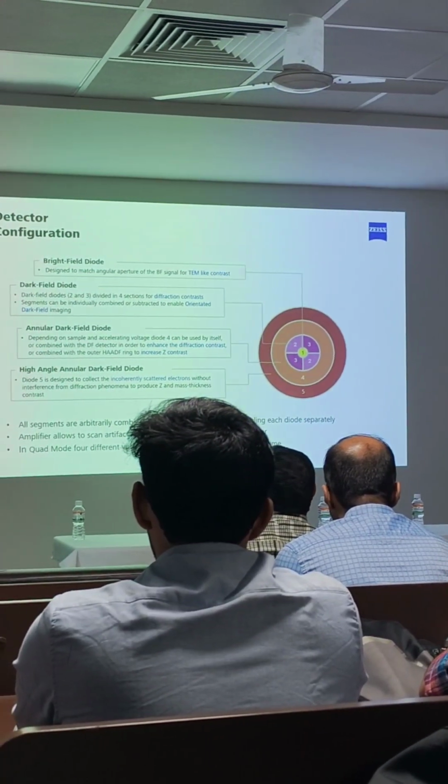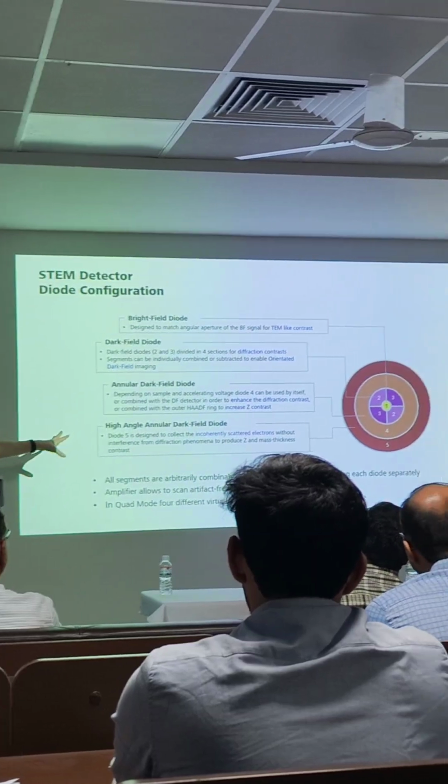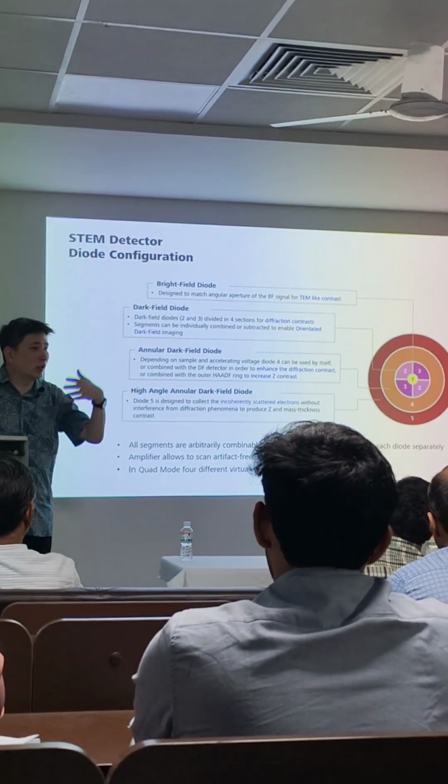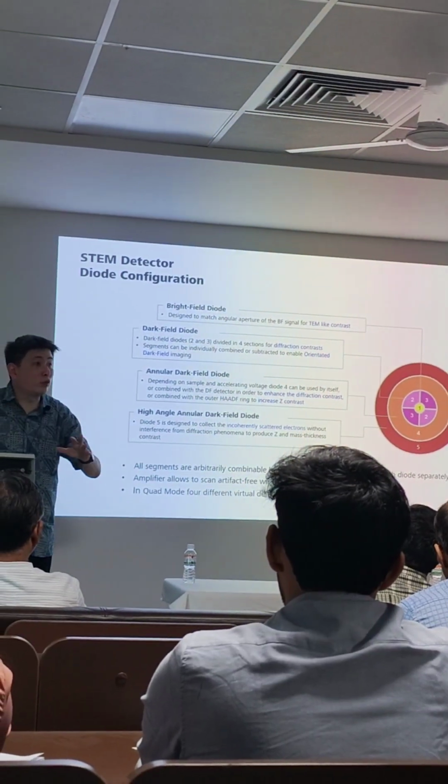So again, I won't go into detail because this is a course on its own. What is the dark field mode? We can discuss later if you are interested.